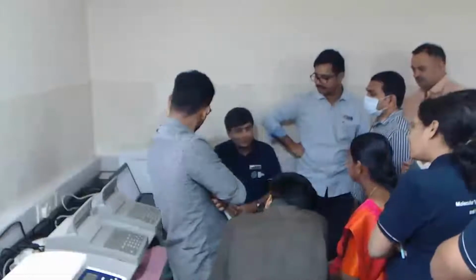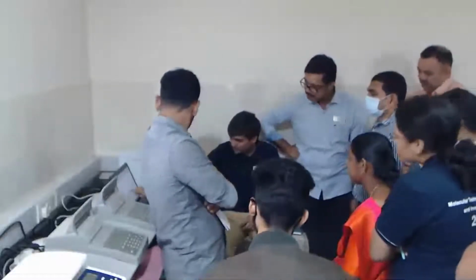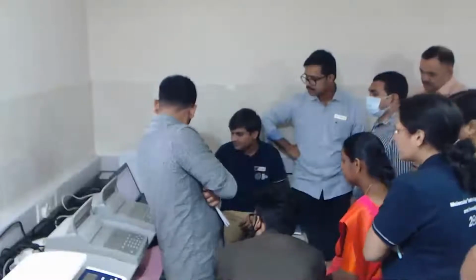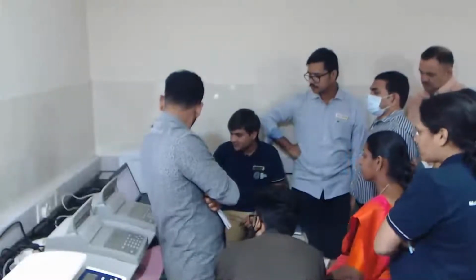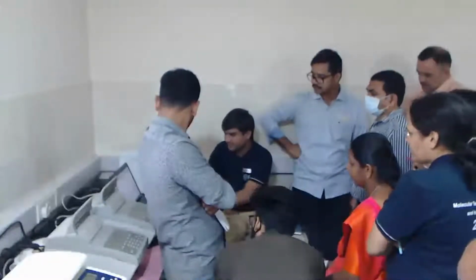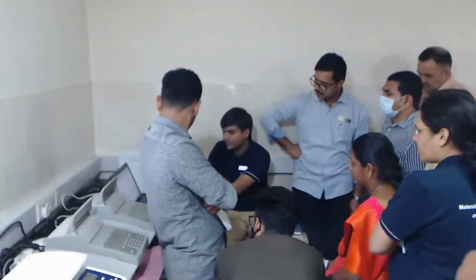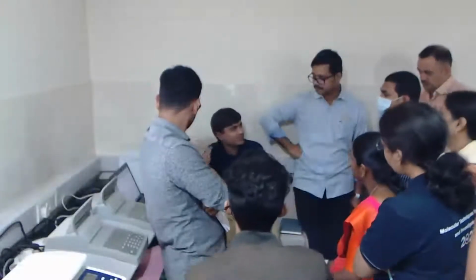So now we need to look at the average library size. Currently it is showing you the peak tables. Then over here we have something called the region table, and we add a region. This much region is my intended region. I will keep somewhere around 175 to 500, because I know what my fragment size should be.